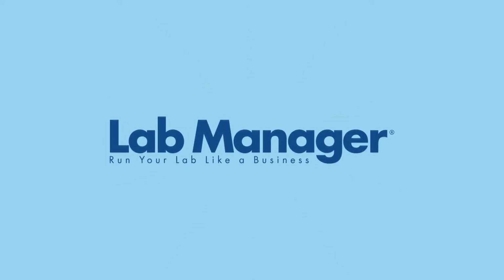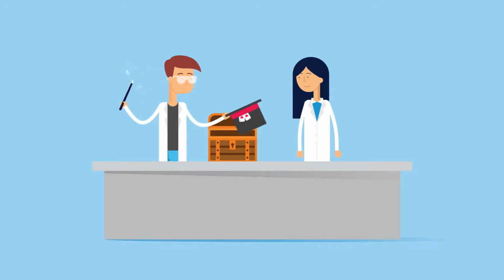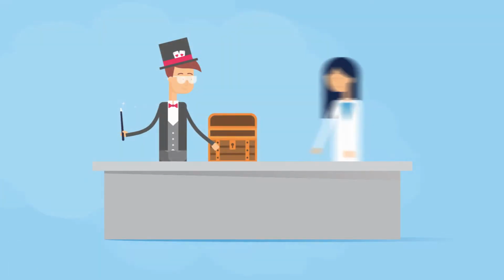Linda's lab requires constant and reliable temperature control for a wide variety of equipment and processes. Selecting new equipment for the lab isn't always a simple task, but when it comes to looking for temperature control equipment, Linda has a few tricks up her sleeve.